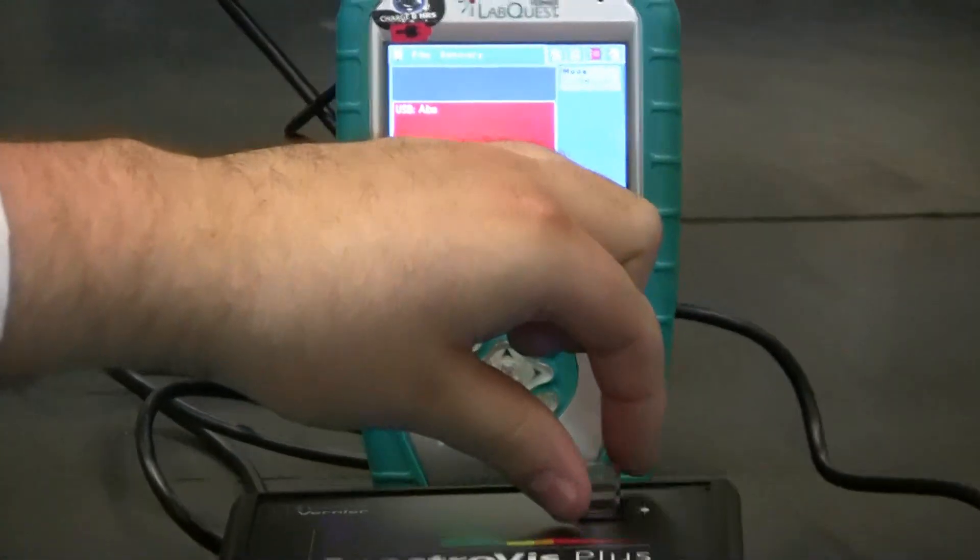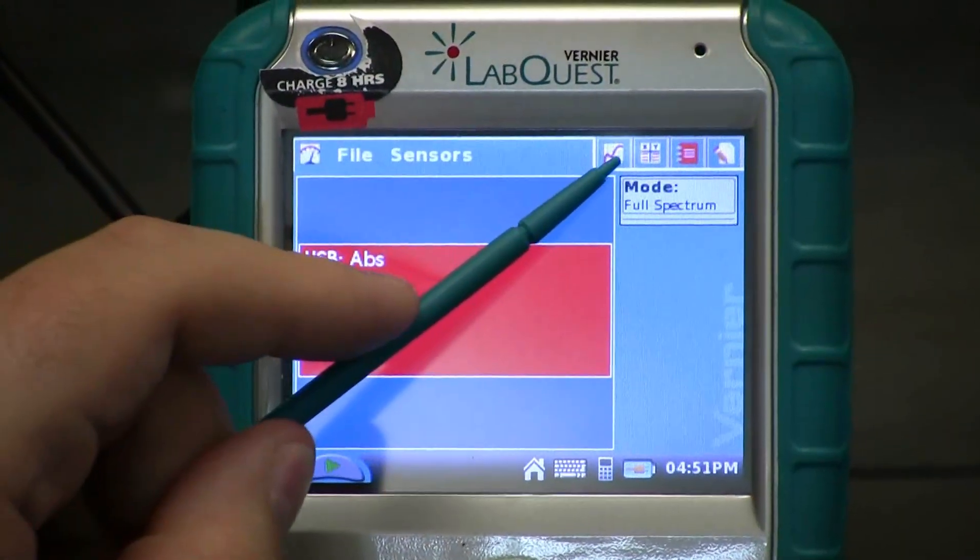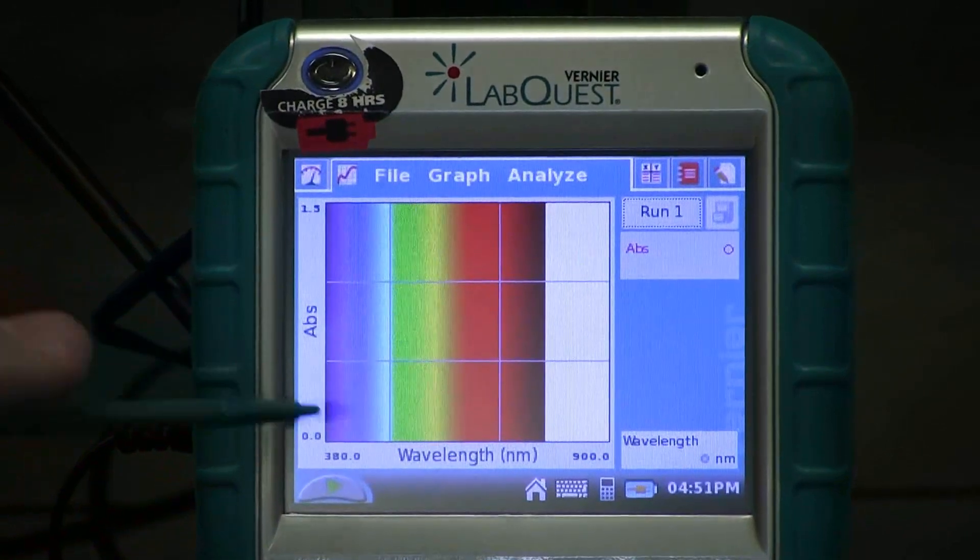Place your diluted stock solution into the cuvette slot. Now, click on the Graph tab and click Play.